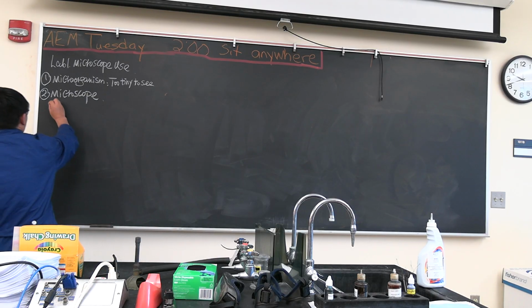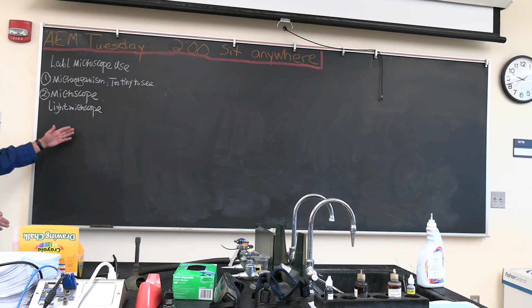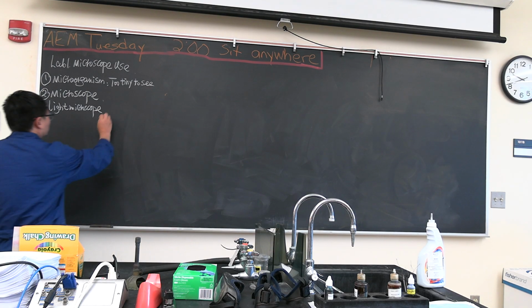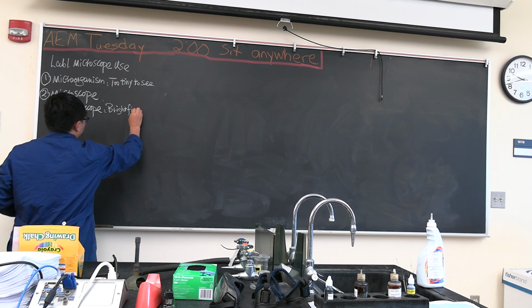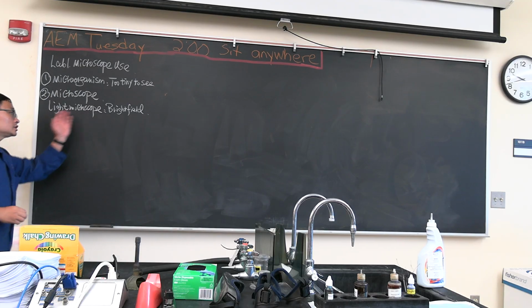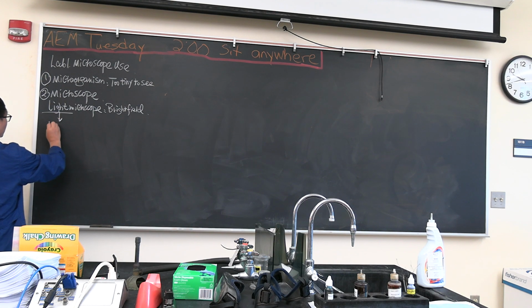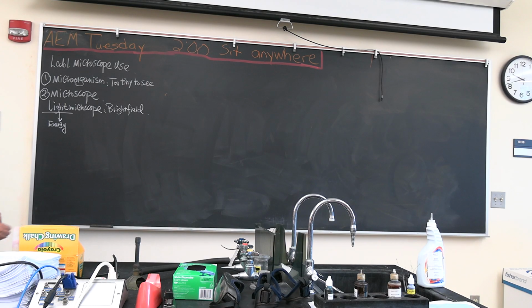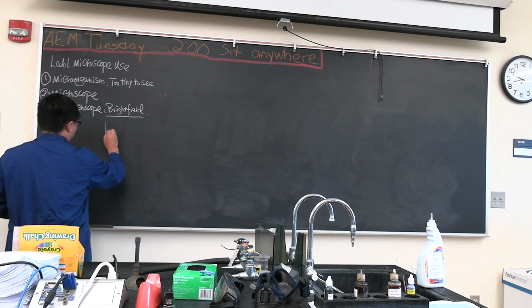This is called a light microscope. And it is also one category of the light microscope we call bright field. So what this means, light microscope, means the energy resource is light. Then what does bright field mean? You certainly already know.